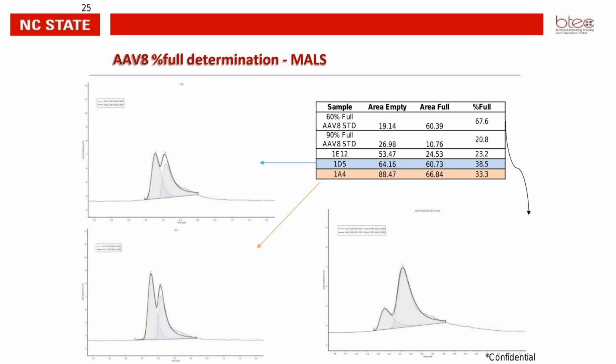On the left side, you can see the two chromatograms wherein we show the elution samples that were tested. We get clear separation of empty and full, and we can quantify the amount of fulls very nicely. The one on the bottom is one of the standards that we tested. We tested this with multiple orthogonal methods, and all of them seem to correlate well with each other.